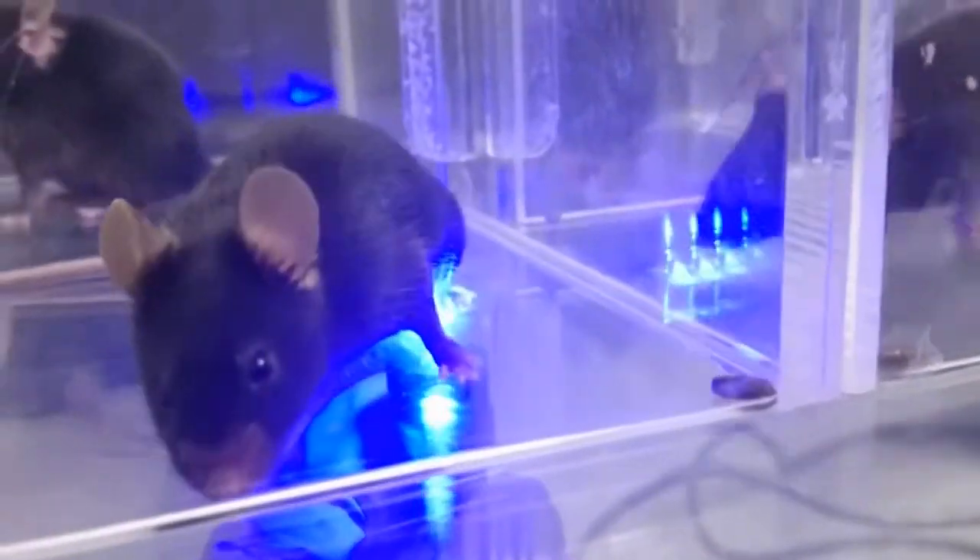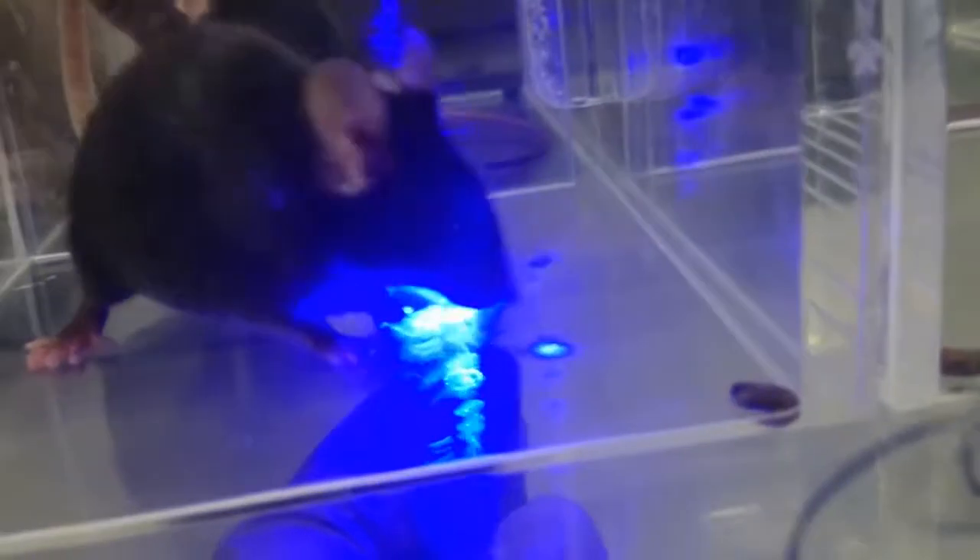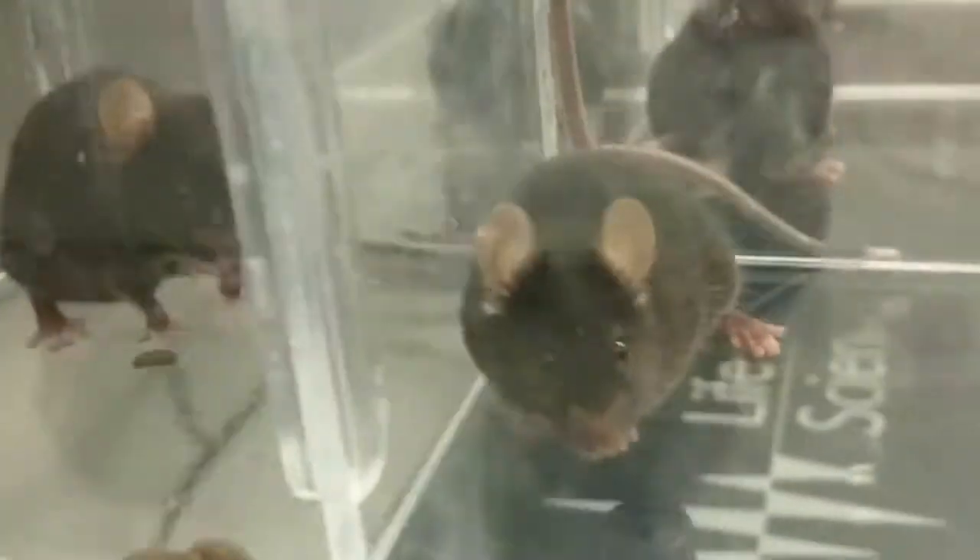Next one. Starting from contralateral — apparently no reaction. Ipsilateral — wow! So contralateral for this one: nothing. Contralateral: nothing. Ipsilateral.